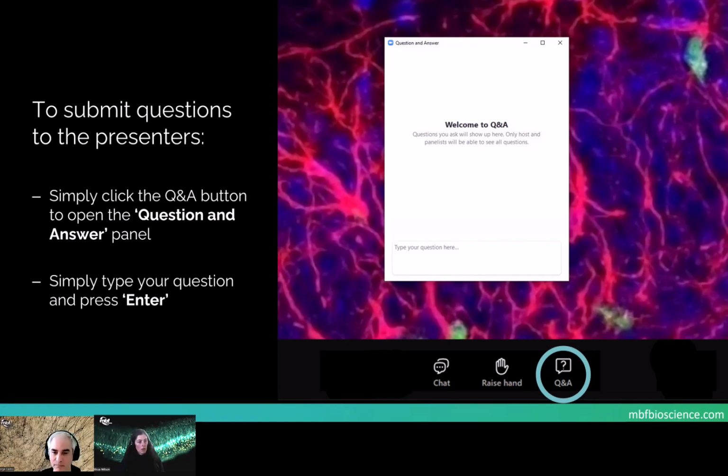And then there was another question about the demonstration and providing the software. So again, that will depend on your images. If you reach out to us, if you're interested, we will do the evaluation on the images with our current classifiers, and then depending on the results of that, we can either do a trial, allow you to trial the software, or work with you to develop a classifier that would work for your cell population.